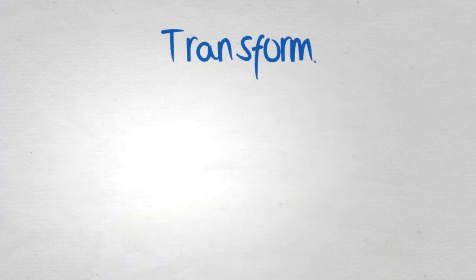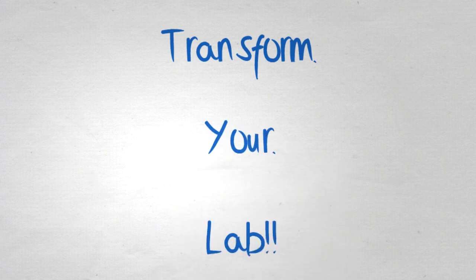We've only scratched the surface of STaCS sample processing capabilities. This software will transform your operations to help you increase productivity and prevent errors.